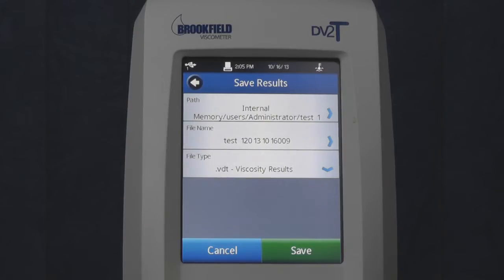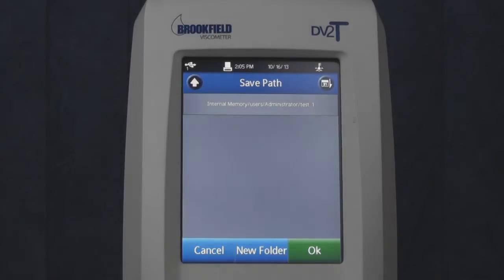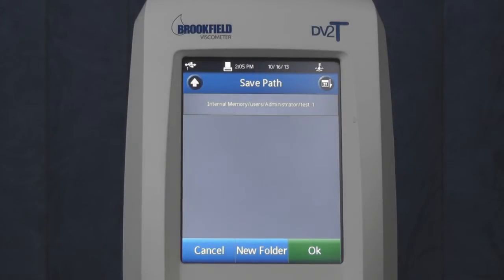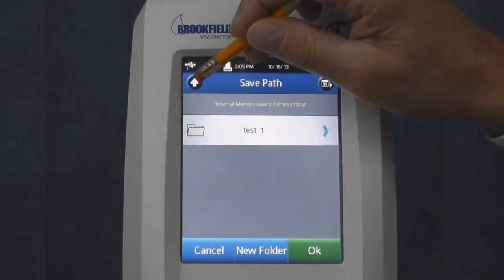If the path and file name are correct, touch Save. If you would like to modify the path, touch the Path box, then in the upper left-hand corner, navigate back to change the path.